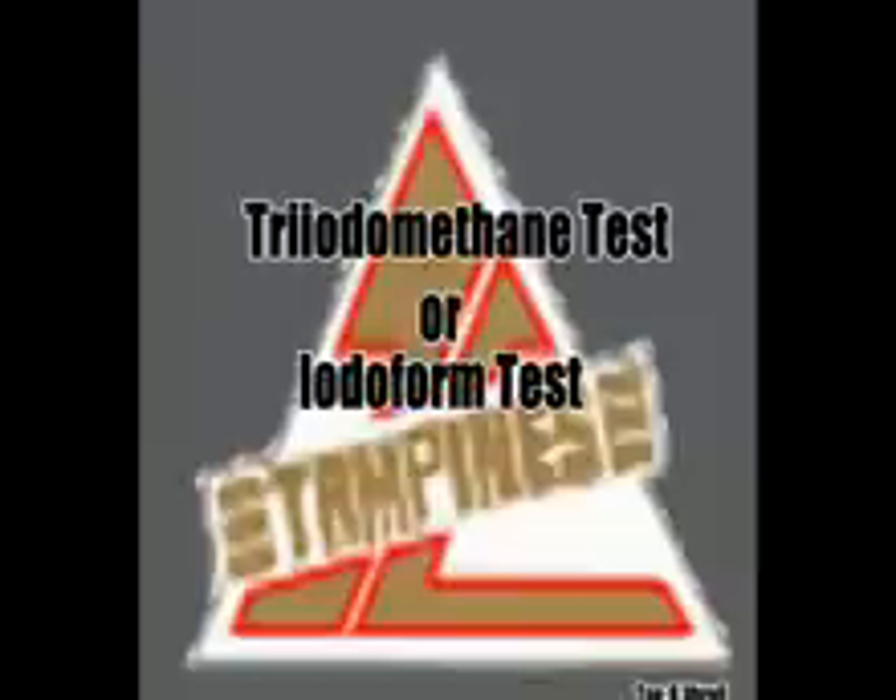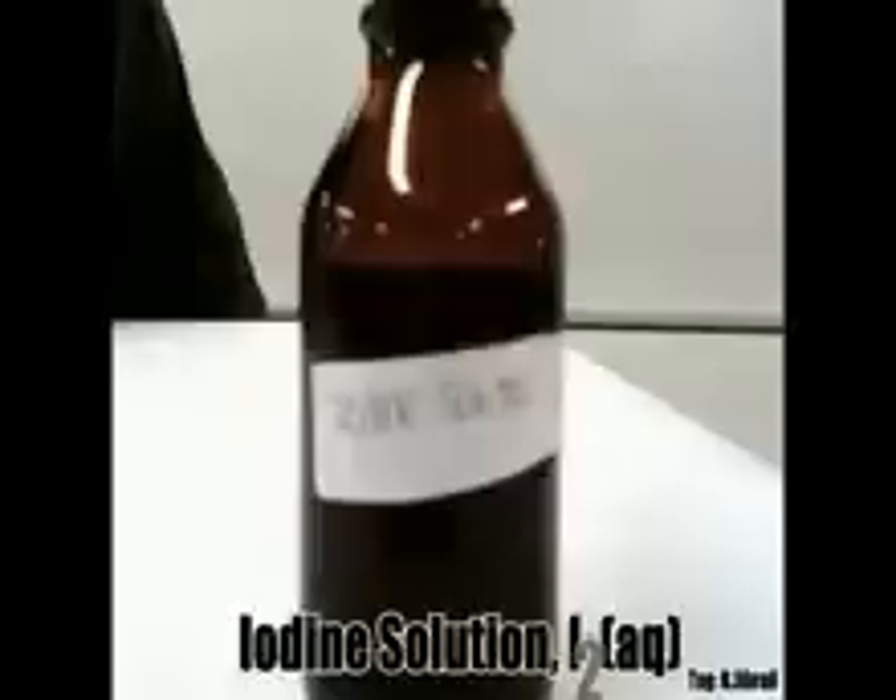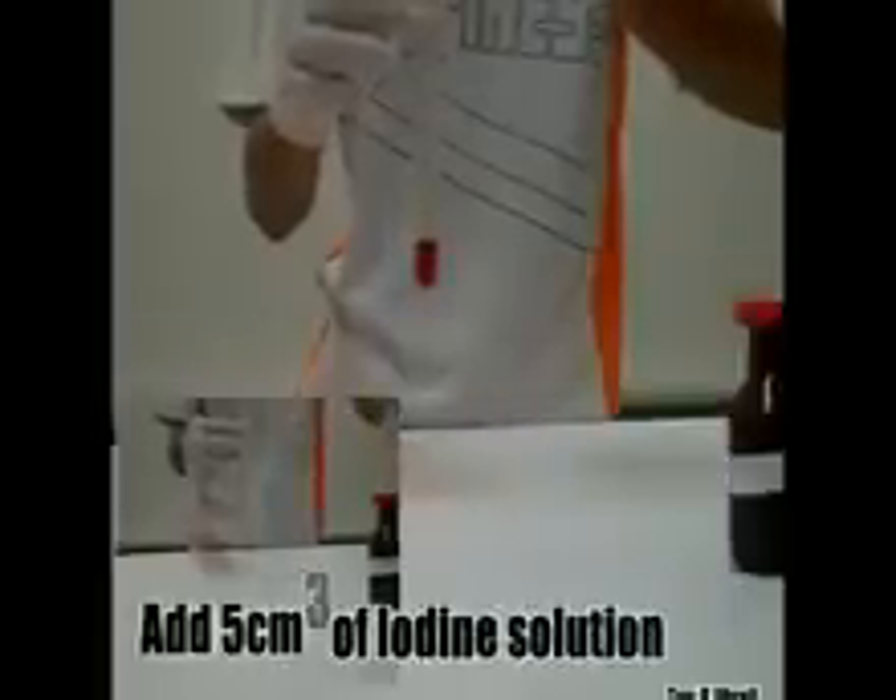Iodoform test, also known as the triiodomethane test. We are using iodine solution. This is the test sample of the carbonyl compound.